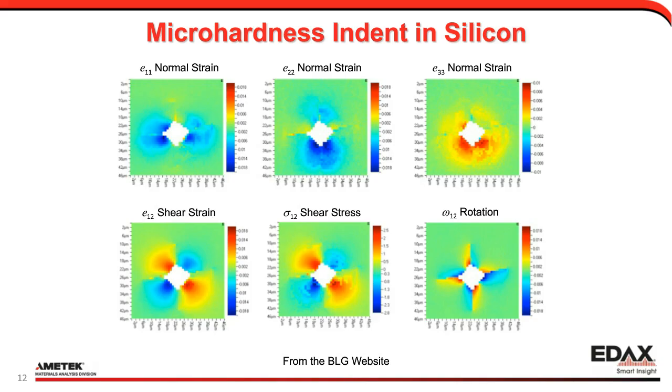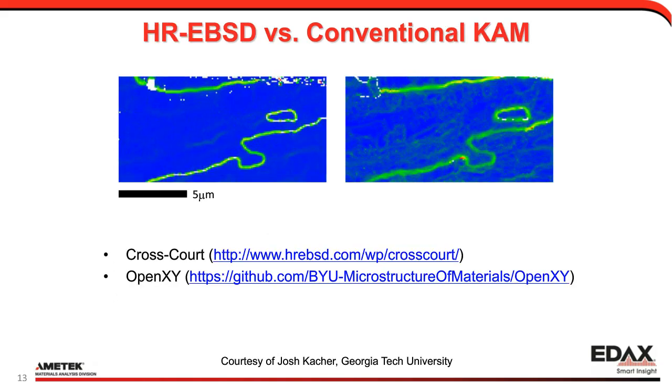And this gives a very nice result. The result I'm showing here is from the BLG website. Here's an example of comparing HREBSD, this technique, versus the conventional KAM, which will be the focus of my presentation. I just wanted to give you an idea of what's going on with HREBSD because I'm seeing it more and more at presentations at conferences, and it is a good development for EBSD.